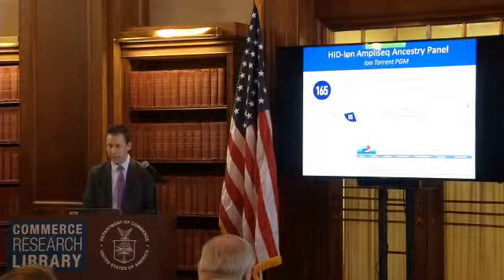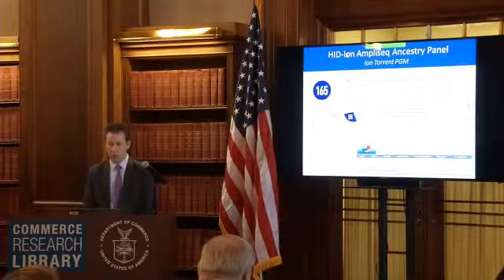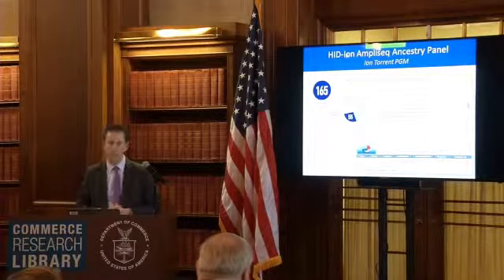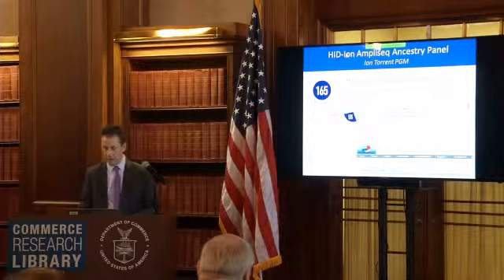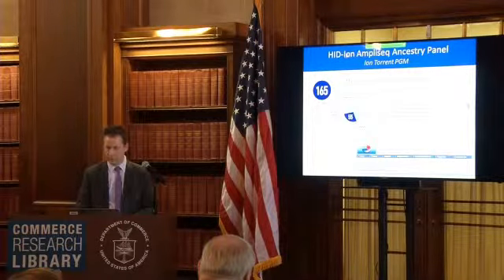I'll just show a little bit of data here. This is a kit from a company called Life Technologies, or Thermo Fisher. This is their ancestry panel of SNPs. It is a set of 165 sequence polymorphisms, and these were selected in the research community to estimate biogeographical ancestry. We can run these on a sample. These are some of the papers that led to this work, and there's a database for searching them as well.